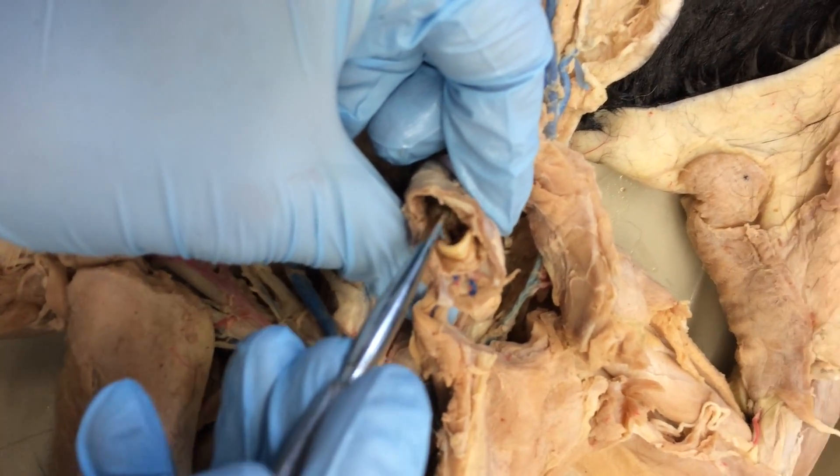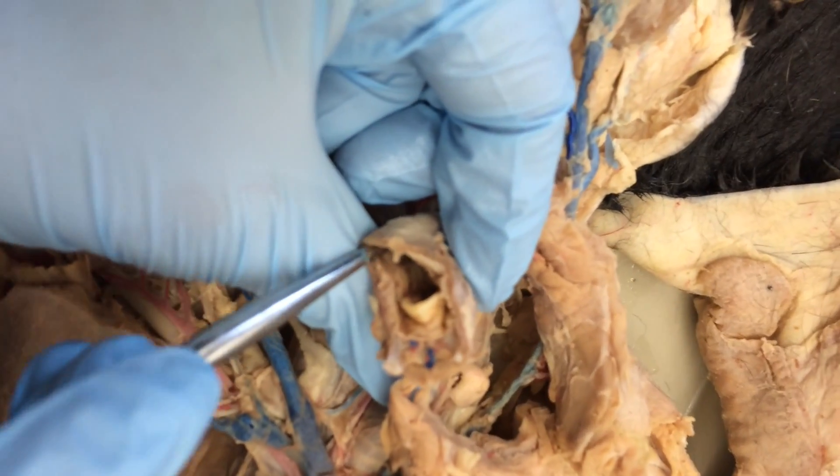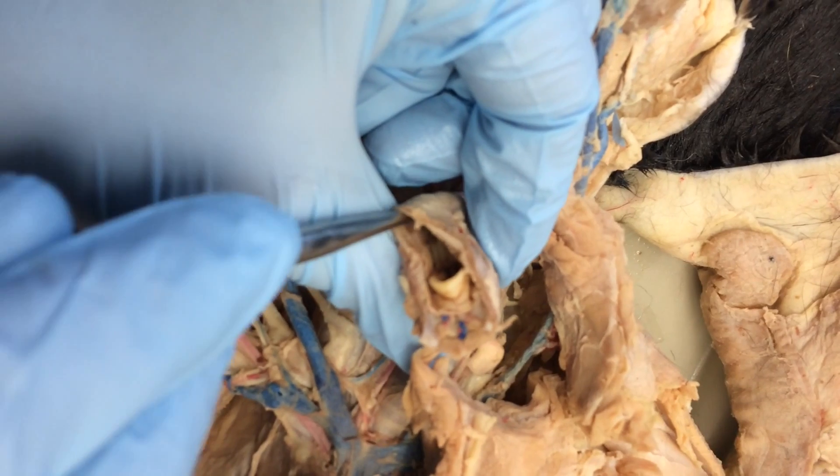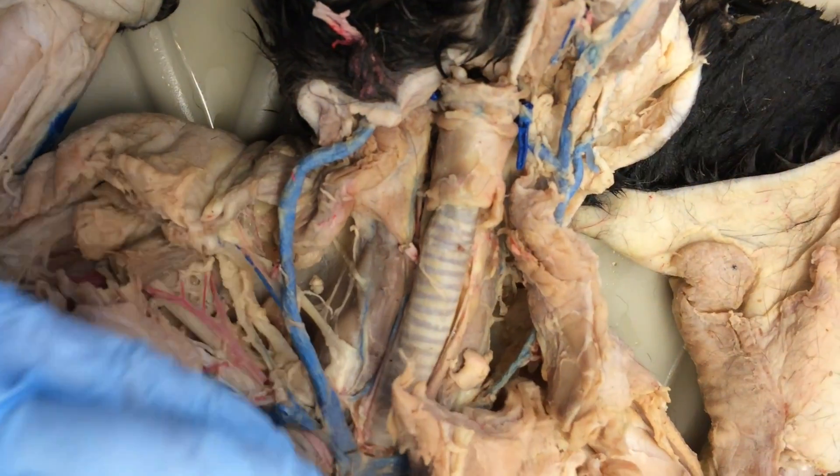There's a vocal cord right there — it's the only thing in there if you were to identify it on a practical. So that's the trachea, and the trachea leads you to the lungs.